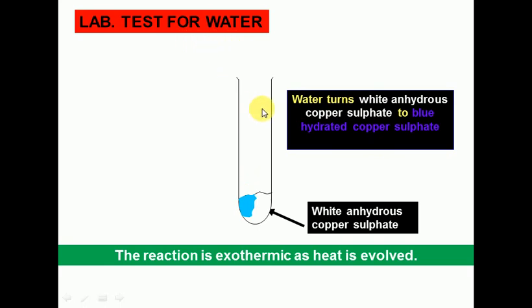And for this test, we required anhydrous copper sulfate, which is having white color.